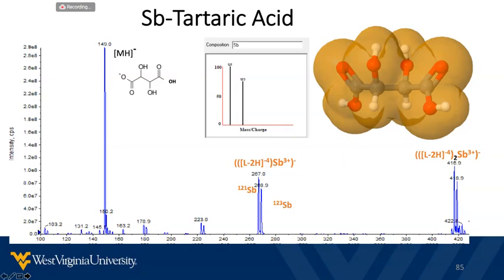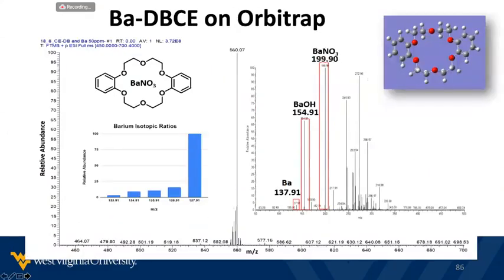So it works fine, but now we have to use two complexing agents, one for lead and barium, the crown ethers, and one for antimony. We have tried alternative crown ethers, such as this example, the dibenzo crown ether, which you can see the structure here, as this one provides improvement in the chromatography.